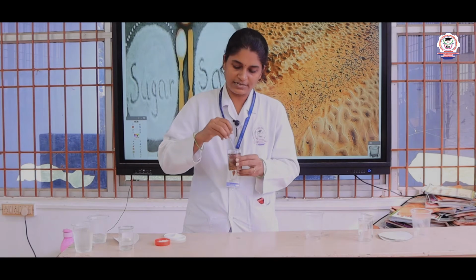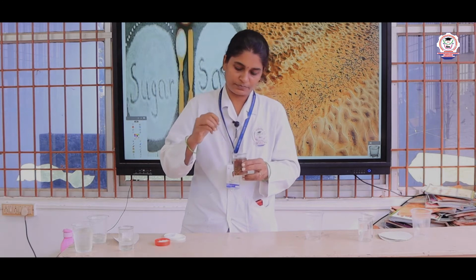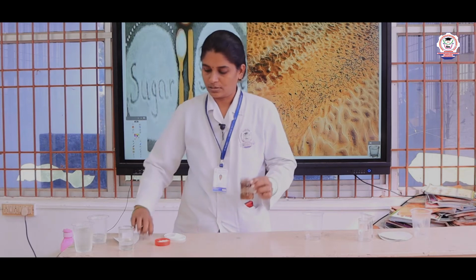As I did for salt and sugar, I am again stirring this with the water. Now the water is completely impure. The sand and everything settle at the bottom, and you can see the sand is not soluble in the water. It does not dissolve in the water. So, this is an example of insoluble impurities.